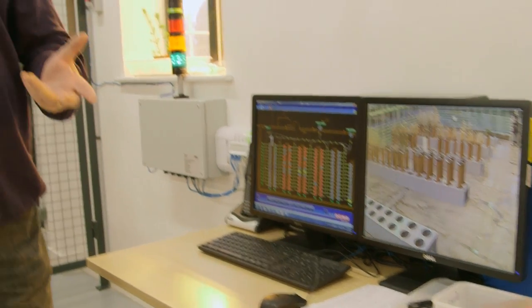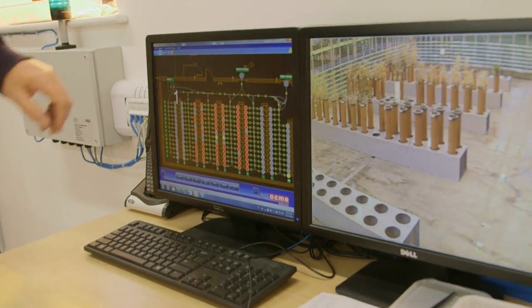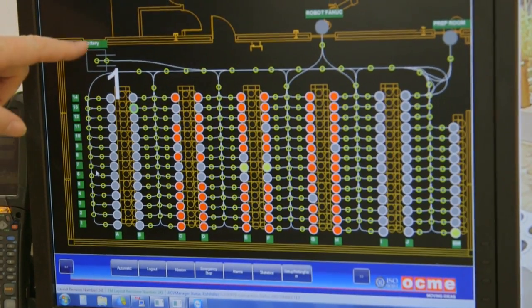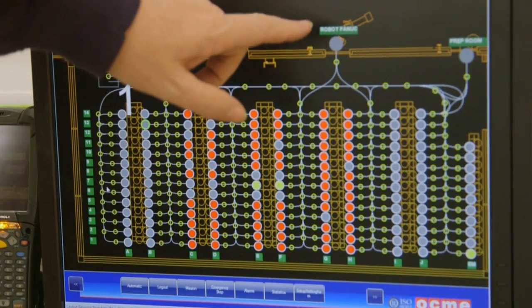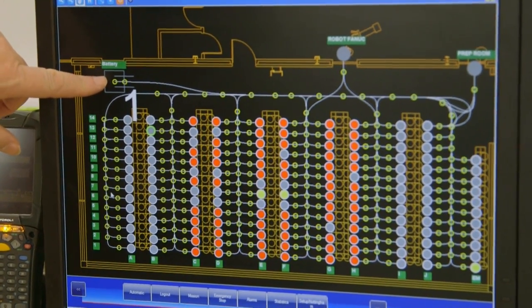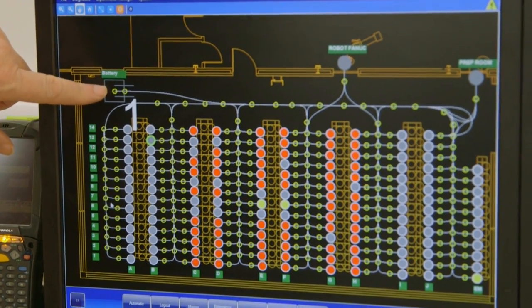When you're using the facility you need to design an experiment, which is a set of samples that are going to be scanned at particular times, and the whole point of it is that it's fully automatic, so we need to program that ahead. We've had an interface built which shows a map of the facility. The round circles are the samples; along here is the path that the robot moves along. Here's the robot arm and here's the battery system. The robot is self-charging — it will go back to base and charge up.